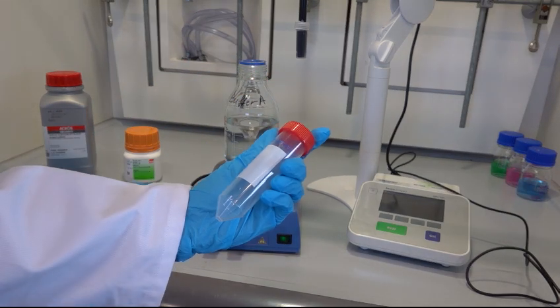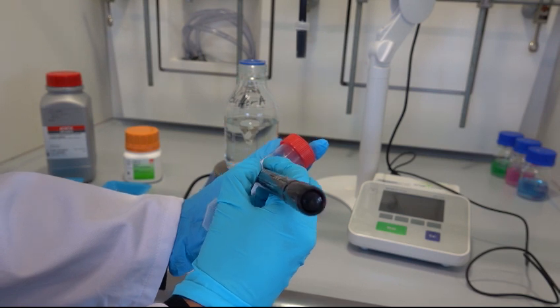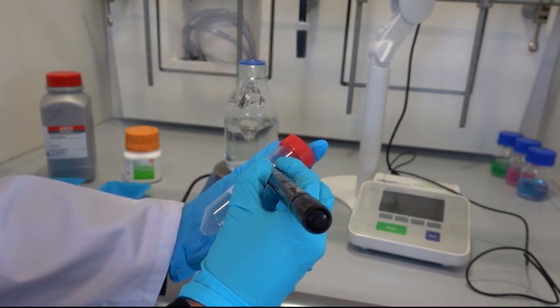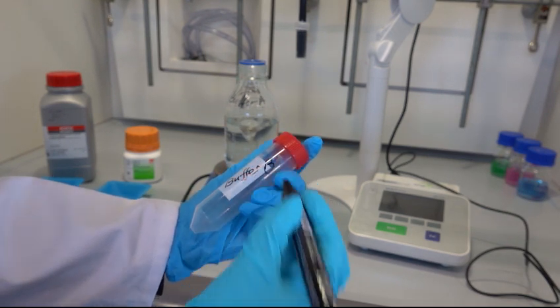Meanwhile, we could take a 50 ml falcon tube for preparation of 50 ml of buffer B and label it.